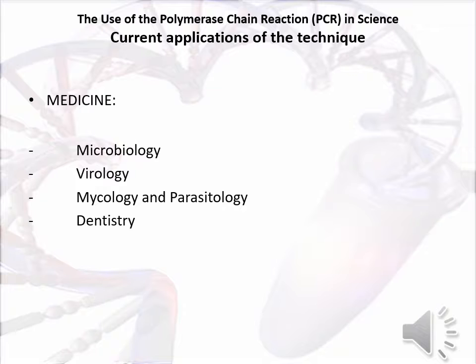Mycology and parasitology. Polymerase chain reaction can be used in early identification of microorganisms to promote efficient diagnosis and treatment of fungal and parasitic infections.